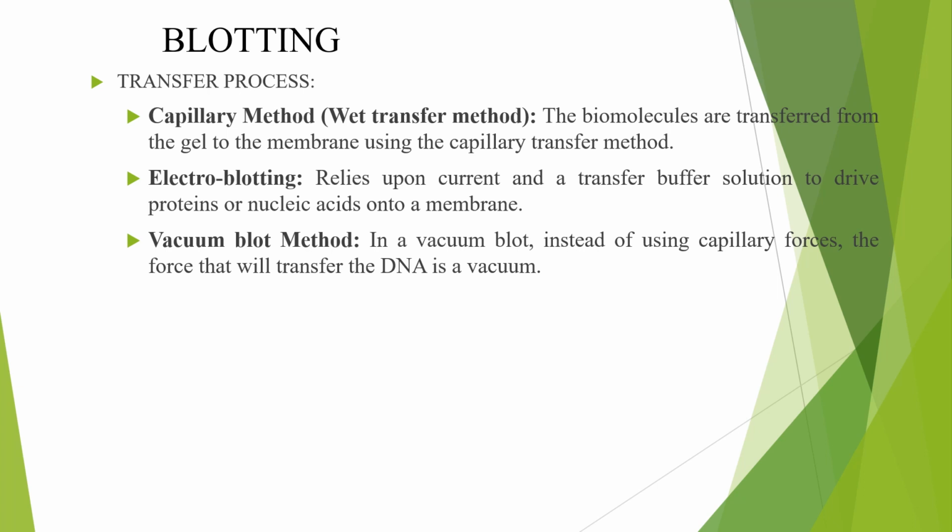In this, the biomolecules are transferred from the gel to the membrane using capillary transfer. Second type, electroblotting, relies upon current and a transfer buffer solution to drive protein or nucleic acids onto a membrane. Third type, the vacuum blot method: instead of using capillary force, the force that transfers the DNA is a vacuum.